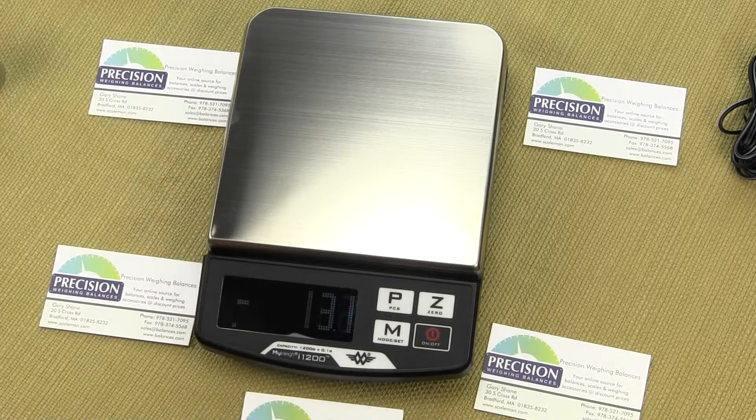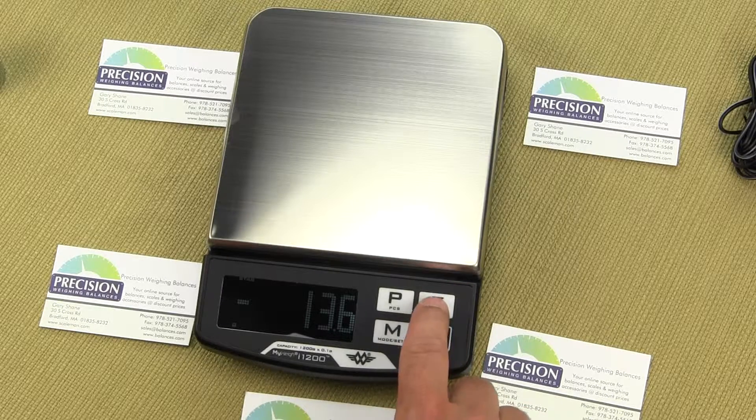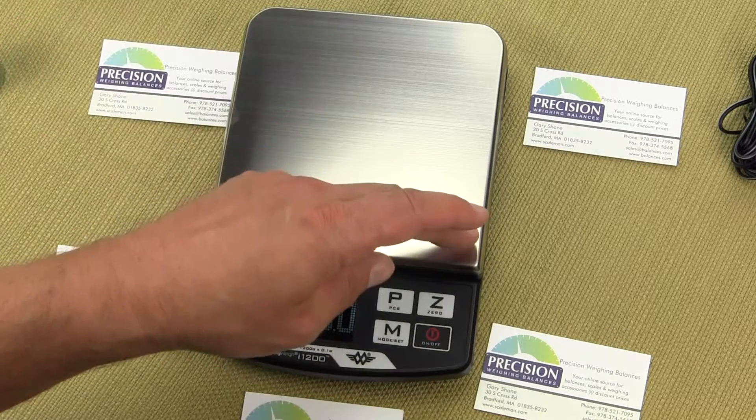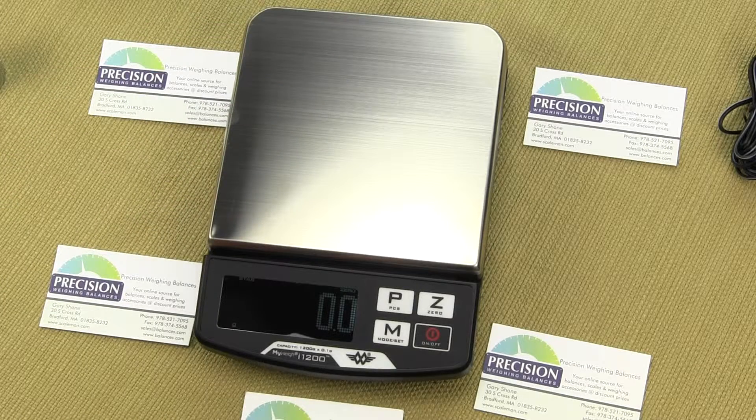To zero the balance after removing the pan, simply press the Z key to tear it out. Regarding calibration — we have a 5.8 by 5.8 inch stainless steel removable platform.